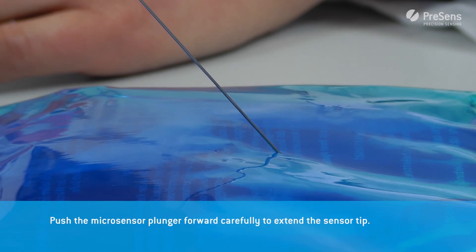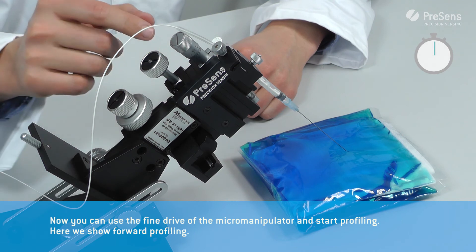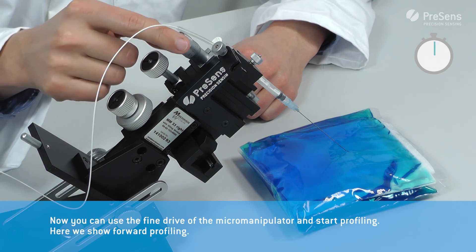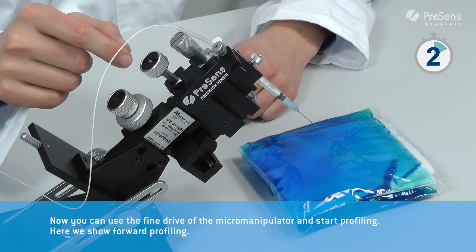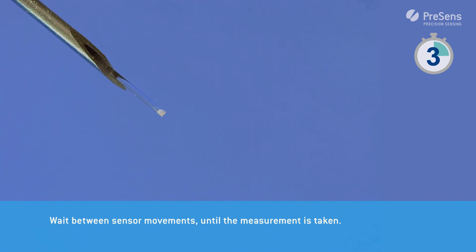Push the micro sensor plunger forward carefully to extend the sensor tip. Now you can use the fine drive of the micromanipulator and start profiling. Here we show forward profiling. Wait between sensor movements until the measurement is taken.